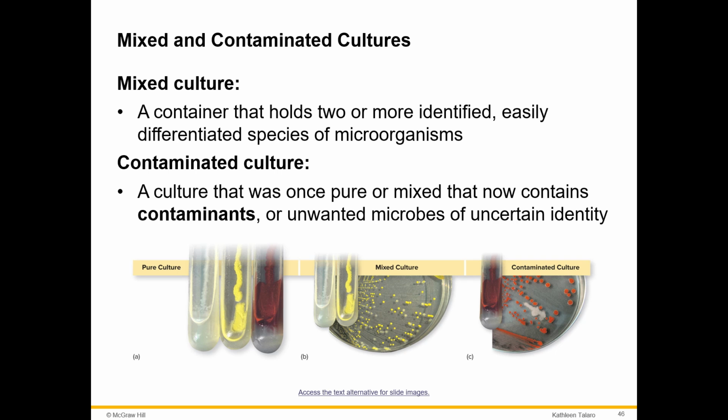Mixed and contaminated cultures. When we're talking about patient specimens, most patient specimens are going to be mixed cultures, and some are going to be contaminated. So if you think about it, let's take a nasal swab from a patient. Well, that nasal swab has tons of different types of microorganisms. It's never going to be that one organism that we're looking for. So that's a mixed culture.